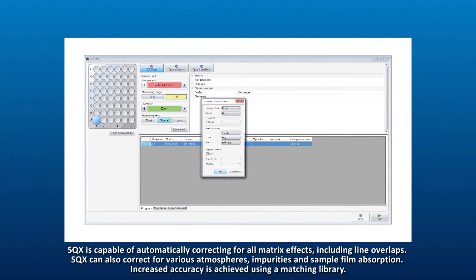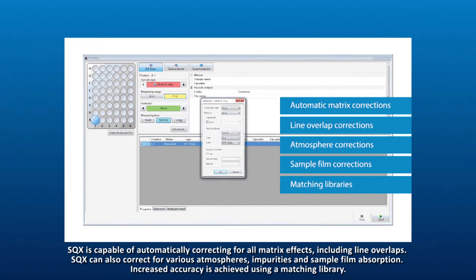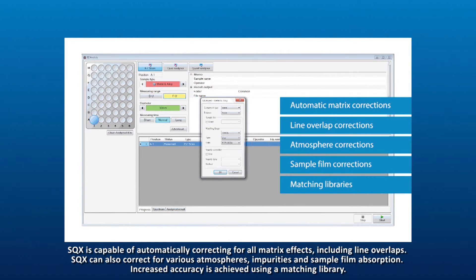SQX is capable of automatically correcting for all matrix effects, including line overlaps. SQX can also correct for various atmospheres, impurities, and sample film absorption. Increased accuracy is achieved by using a matching library.